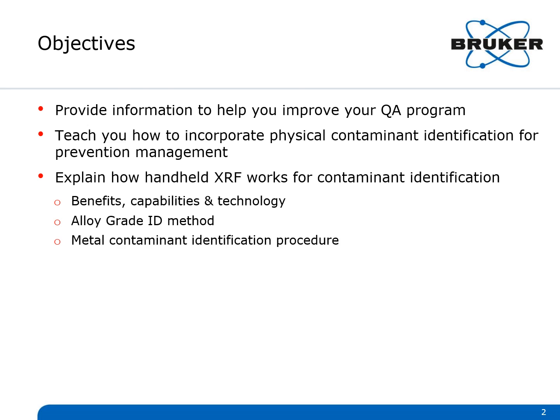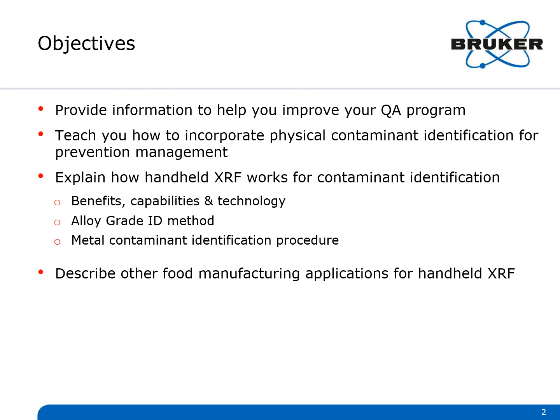We want to explain how handheld XRF works for contaminant identification, including its benefits, capabilities, and technology, the alloy grade ID method, and the metal contaminant ID procedure. We'd also like to describe other food manufacturing applications for handheld XRF.